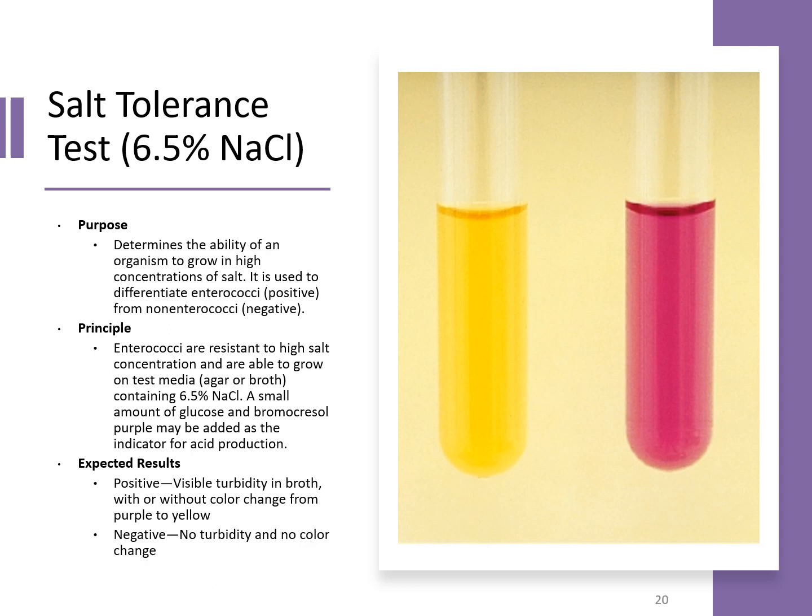And what will happen is, as that organism is able to grow in that salt media, it will start to turn cloudy, and if there's an indicator within that media, then that indicator will change from purple to yellow. And so this would be considered a positive test. It's really hard to tell that it's cloudy, but it is cloudy. And then this one is negative, there's no turbidity, and that indicator has not changed.